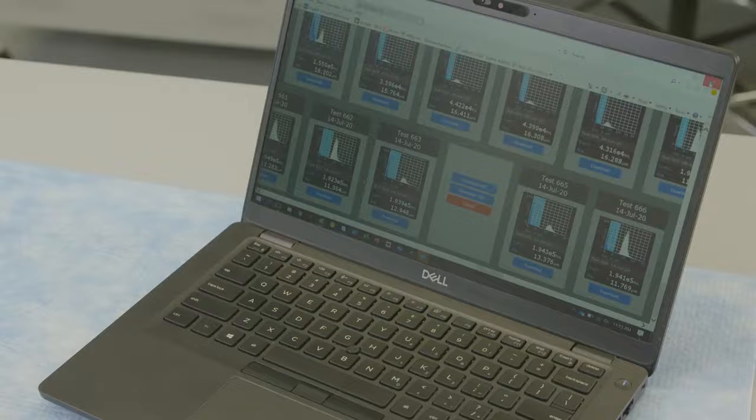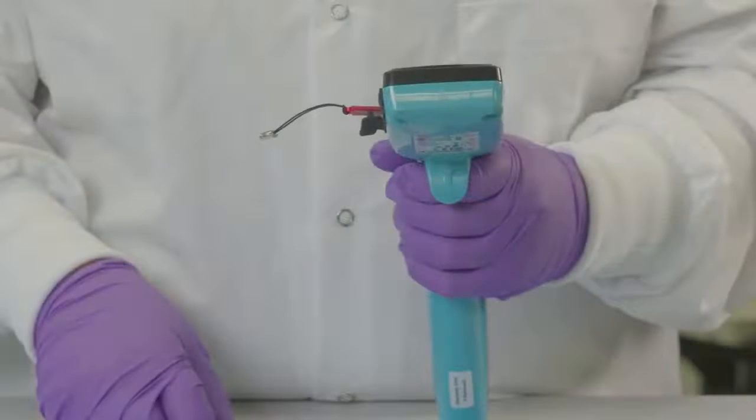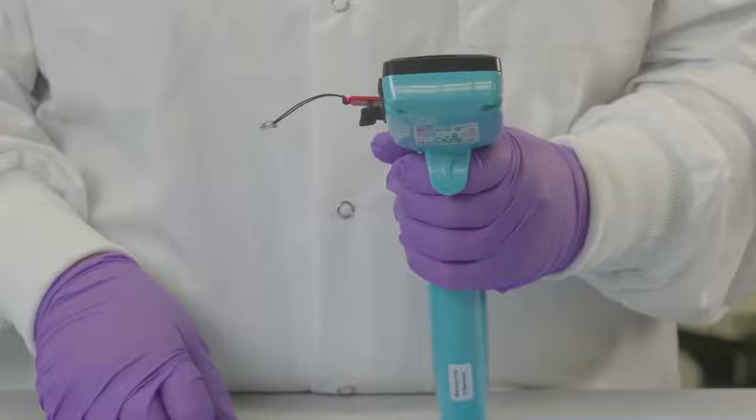To disconnect from the communication, close the browser or computer, or power off the SEPTOR 3.0 by holding the menu button down for several seconds.